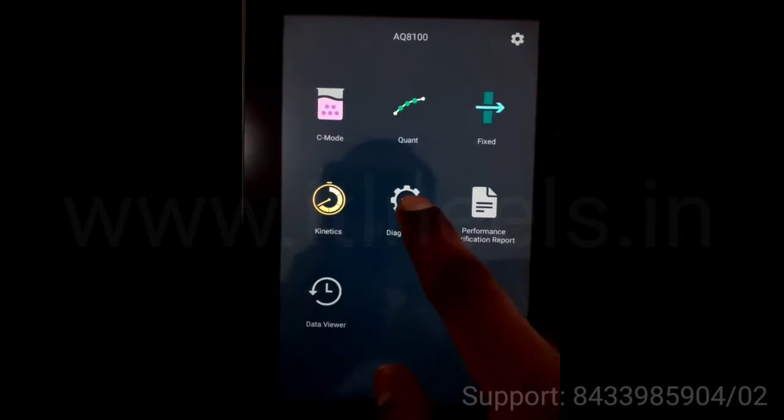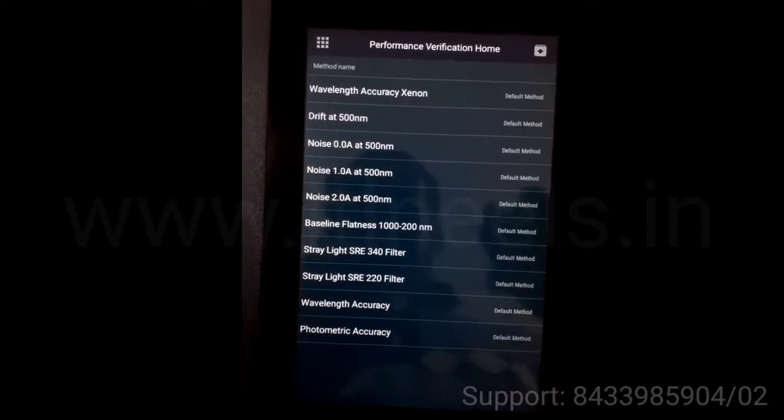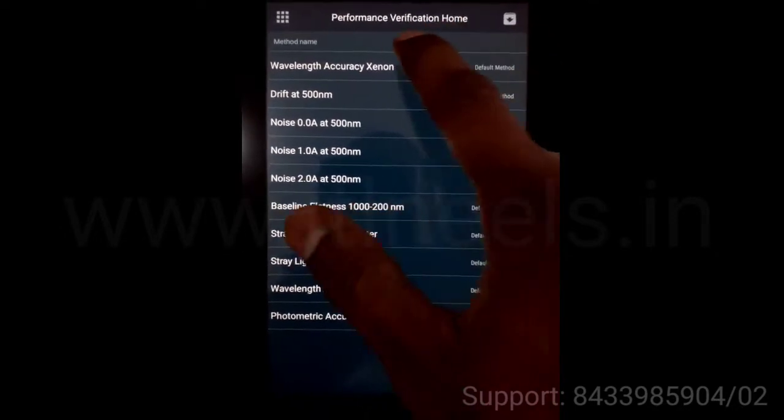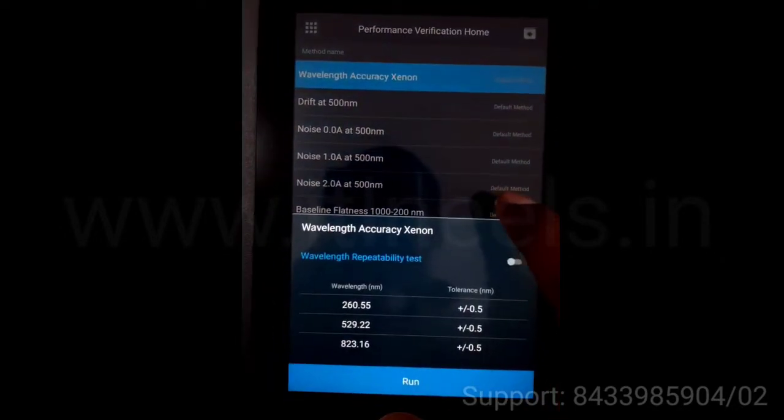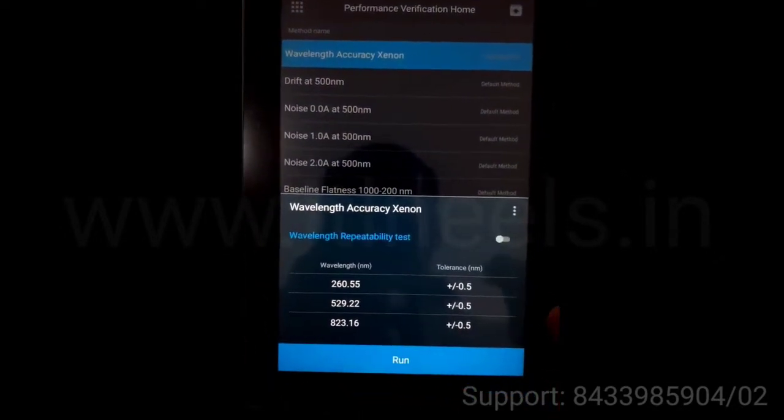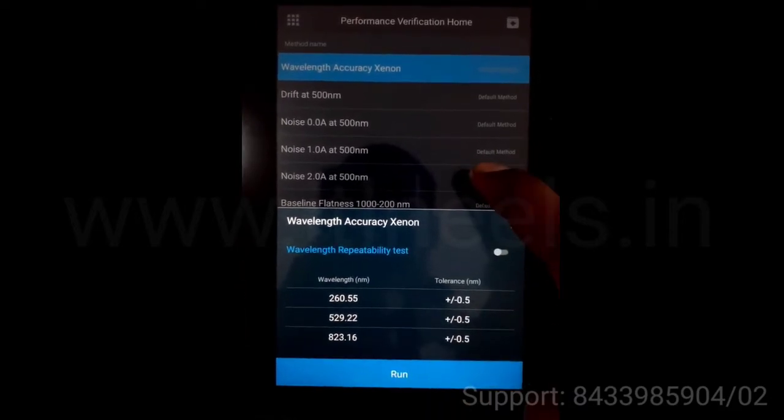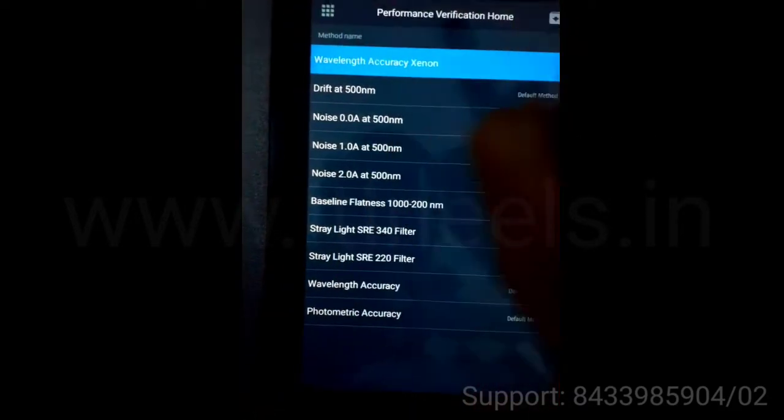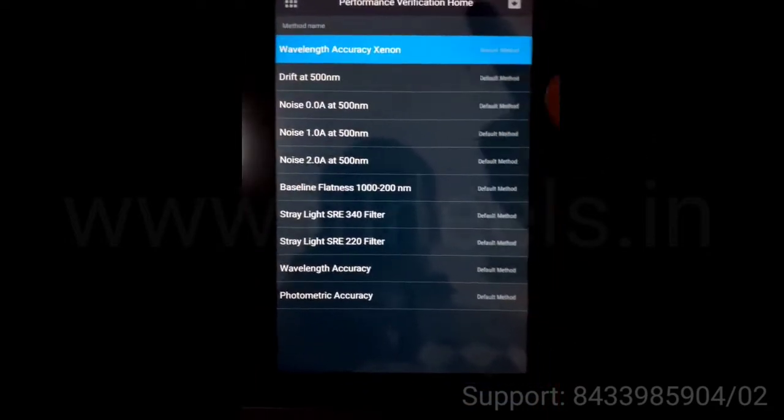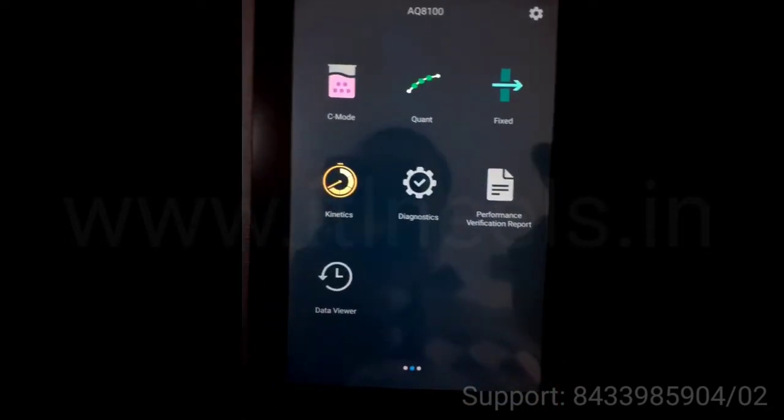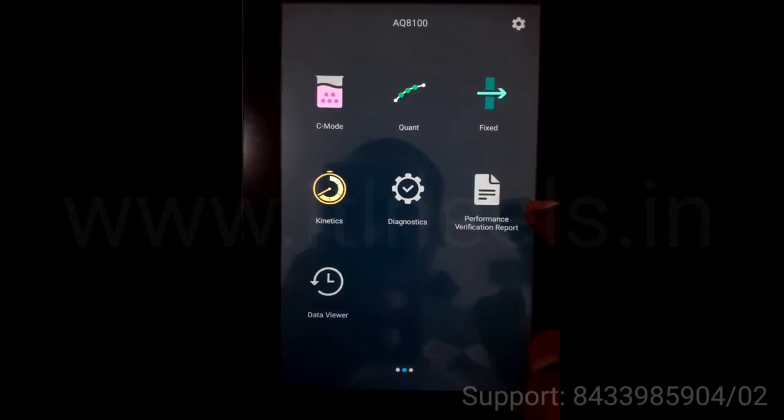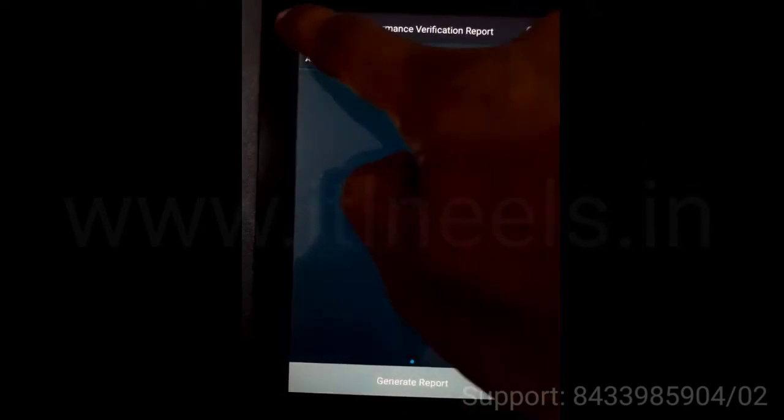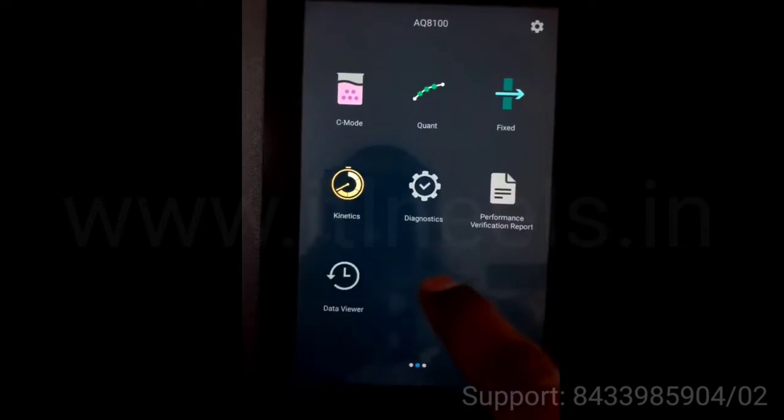Next is diagnostics. These are various performance verification tests you can perform, including wavelength accuracy. It has a xenon flash lamp which has an extended life. All this you can perform. The report will come over here. You can take a printout as well.